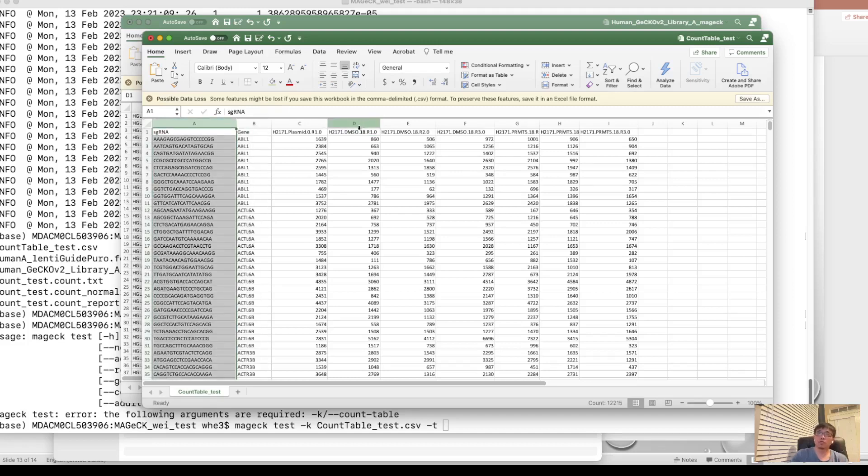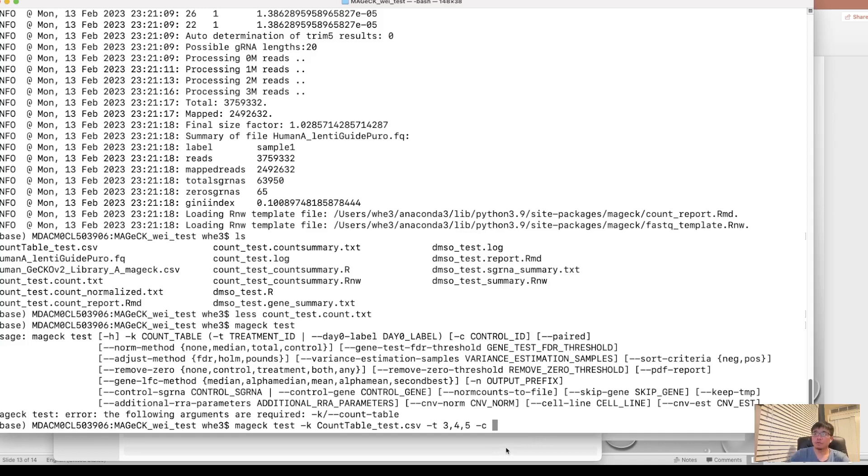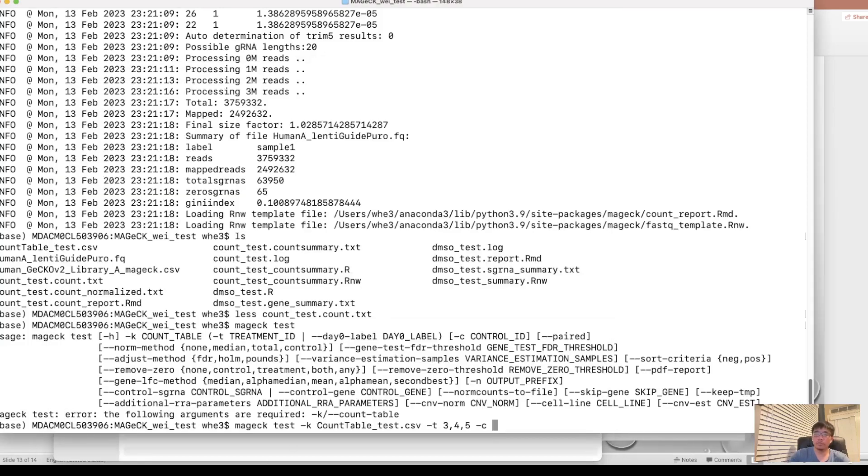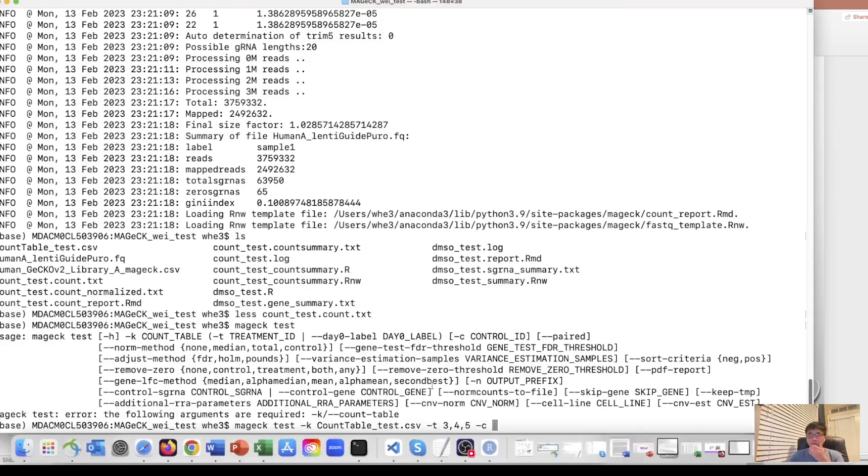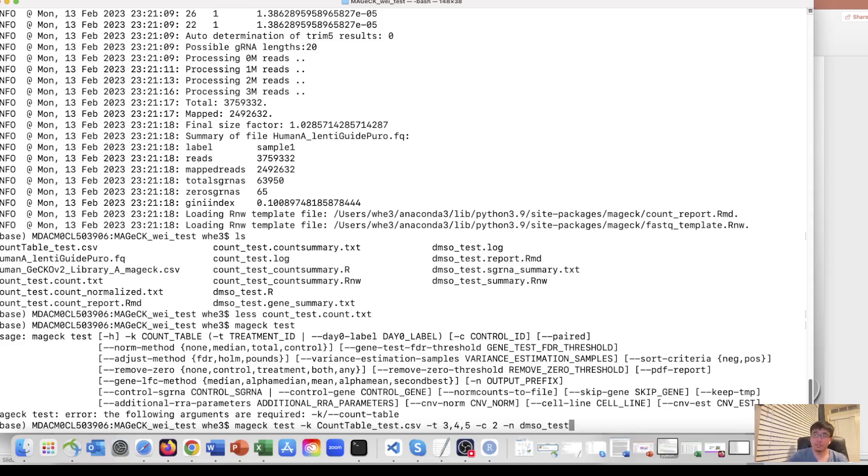So the treatment should be three, four, and five. And control is the third column. It's a plasmid. So the third column is two. And let's put the prefix of the file as DMSO. How about this? Run it.